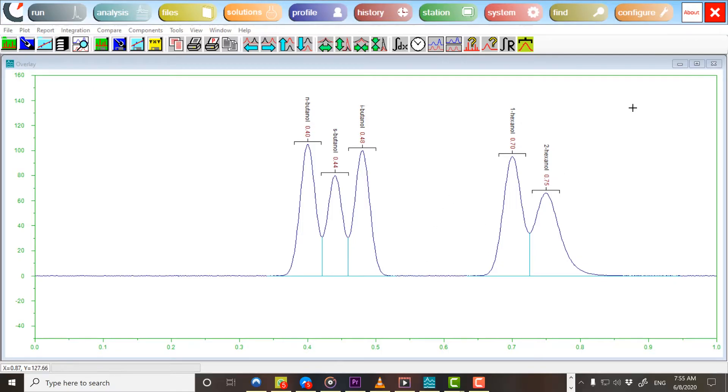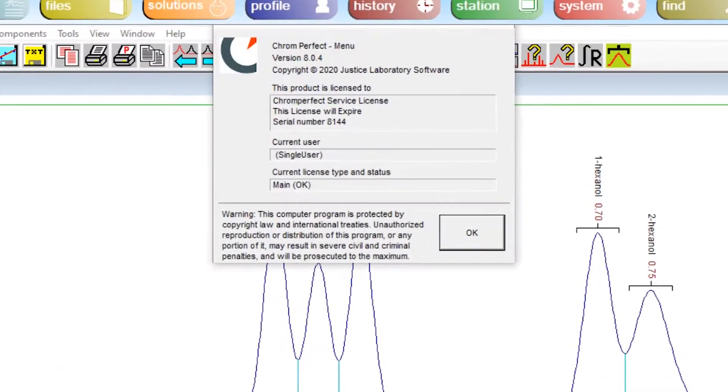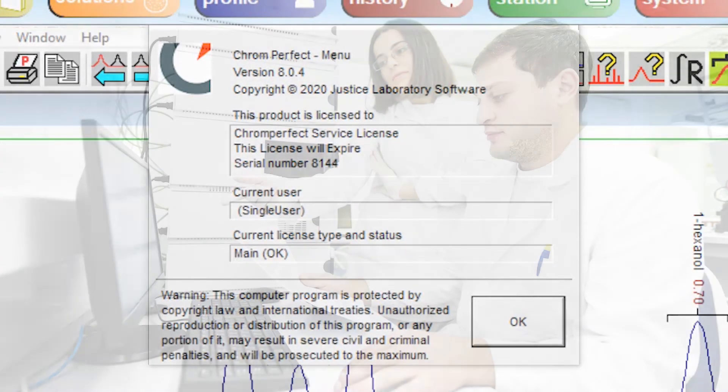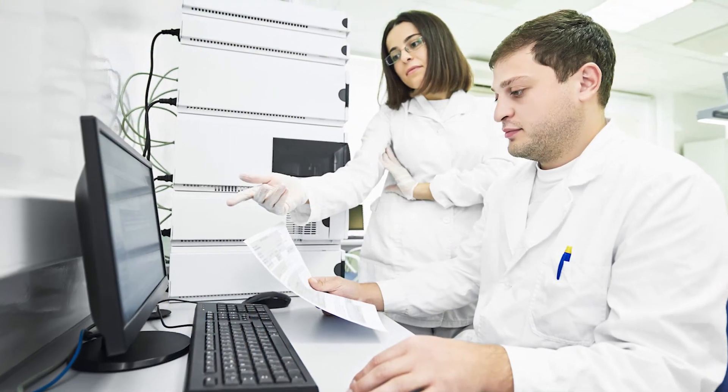This video has been produced using ChromePerfect version 8.0.4. Some features may not be supported in earlier versions, and the processes described may be different in future versions of ChromePerfect.